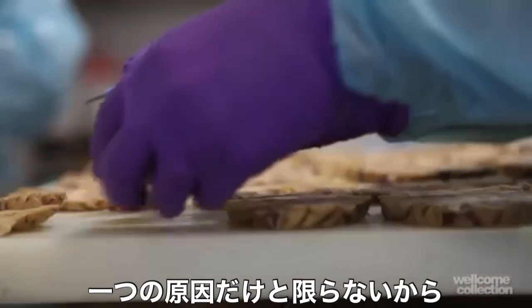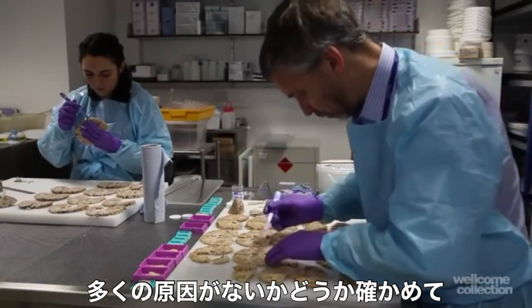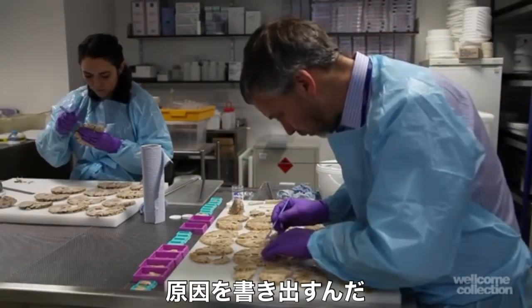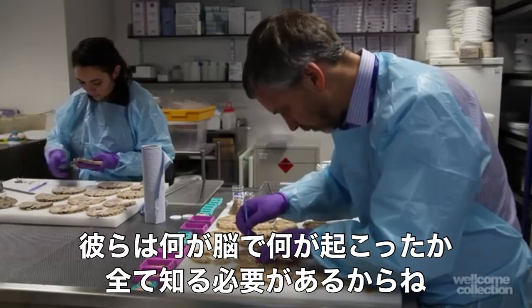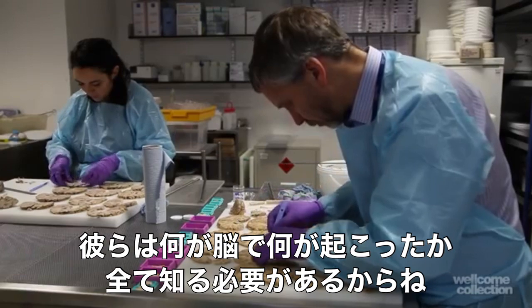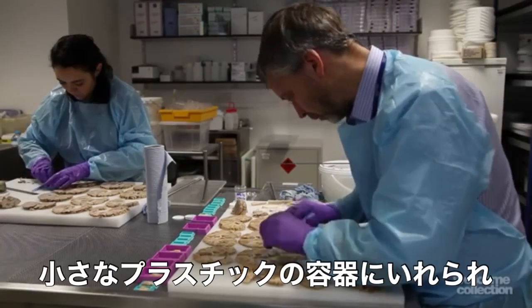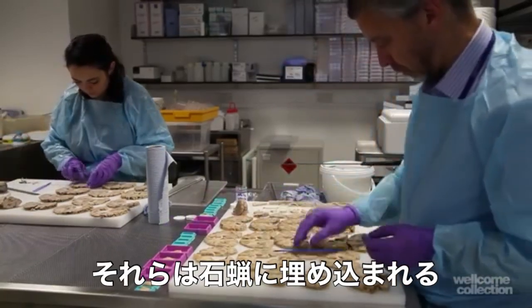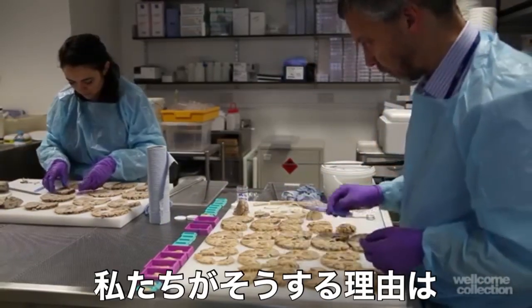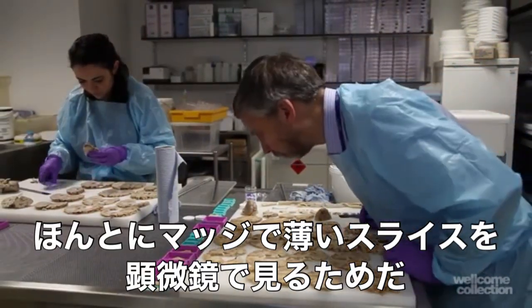We try to work out which pathologies are there, because it's not always just one pathology. We have to make sure that if there are multiple pathologies we write that down — and again it's very important for the researcher, they need to know everything that's gone on in the brain. The samples we take are put into small plastic cassettes, and these are then embedded in paraffin wax, so that we can get very thin slices to look at under the microscope.